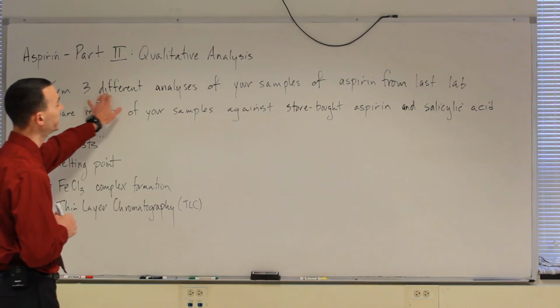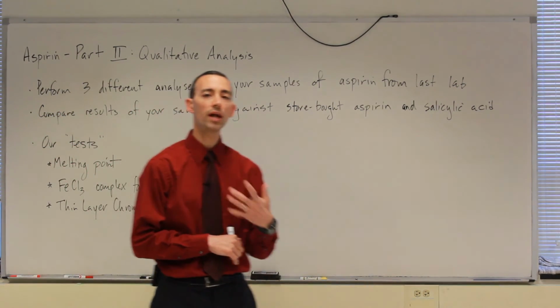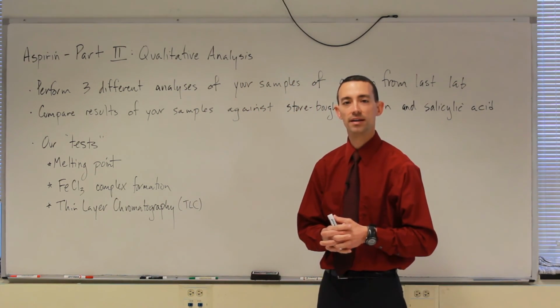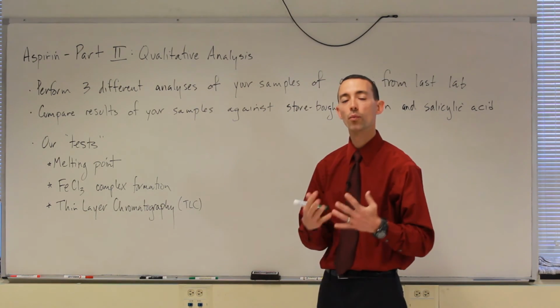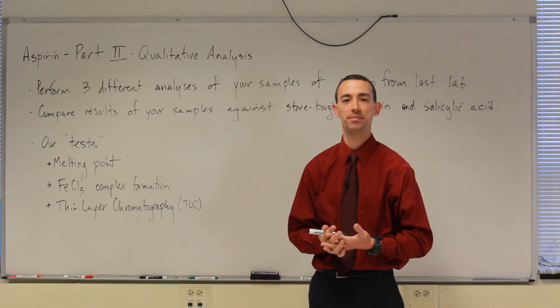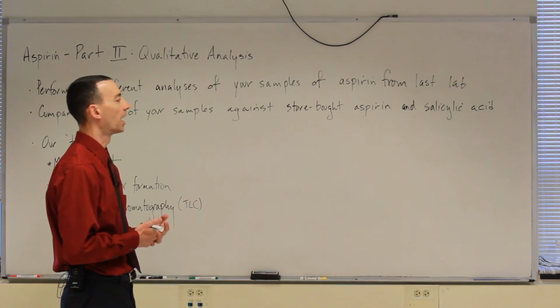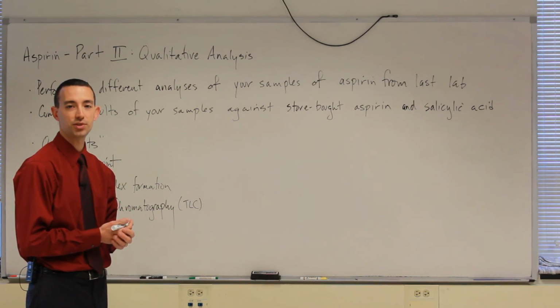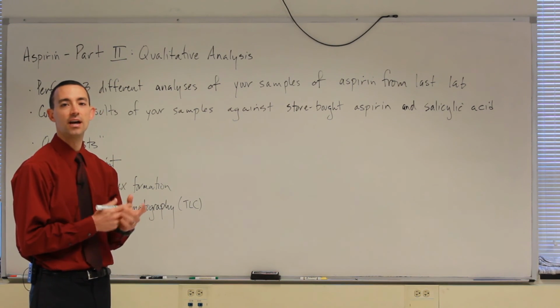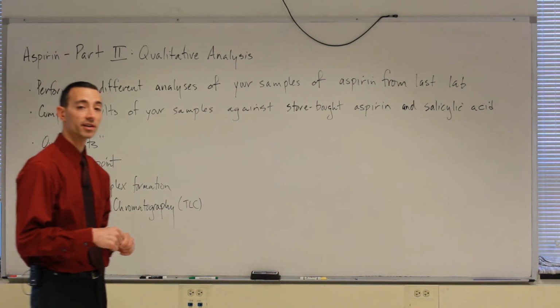So we're going to use three different forms of analysis today. And these are all called qualitative because they're not going to give us any numerical data necessarily to look at, but we're really going to have to put our skills of observation to the test in this lab today. This harkens back to a lot of early chemistry, which is what we often call descriptive chemistry, taking very good notes, being very detail-oriented about comparing two different samples. And that's actually where you'll start your lab today.